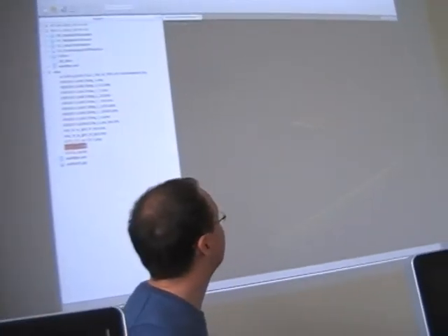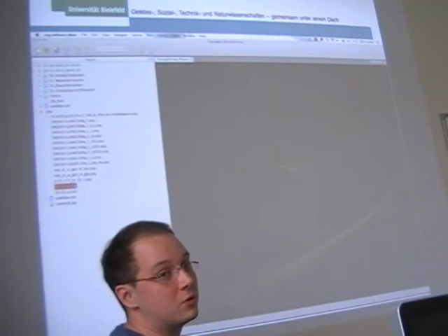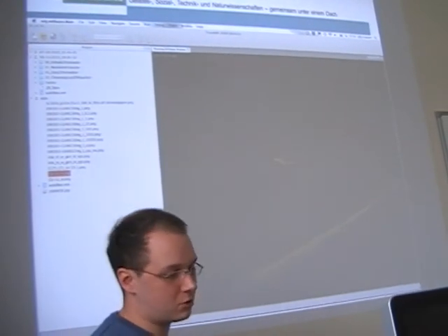This is just playing. This is not really interesting for science yet because there's nothing there that displays actual peak positions or anything, but we're planning on doing this so that you can actually load a peak list to this and select the peaks, and they are visualized in the 3-dimensional view as well.